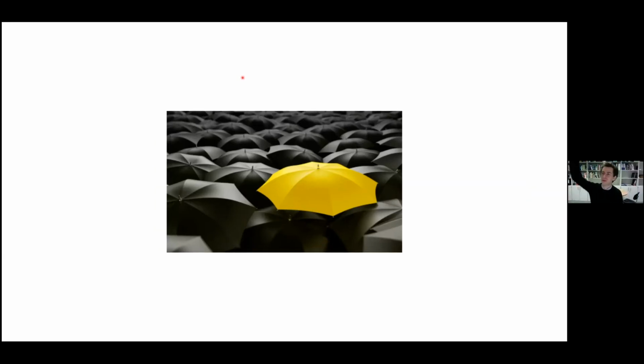And then if you look from a helicopter or a drone, to be more up to date, and you look down, you basically just see a green homogeneous distribution. So the question is, how can you? If molecules were people, you could say, now somebody please wear a red hat, and then you could pinpoint this person. But with molecules, you cannot interact like this.